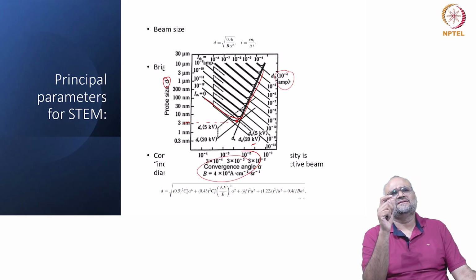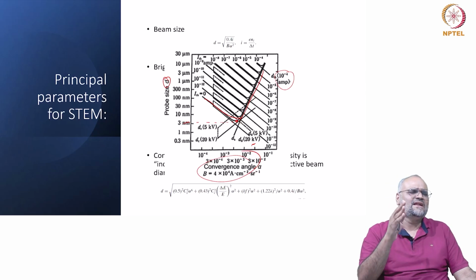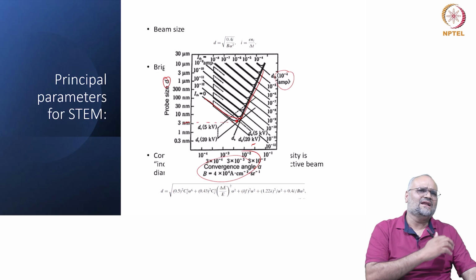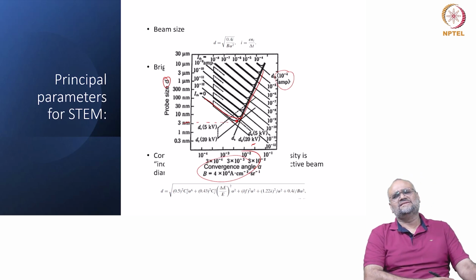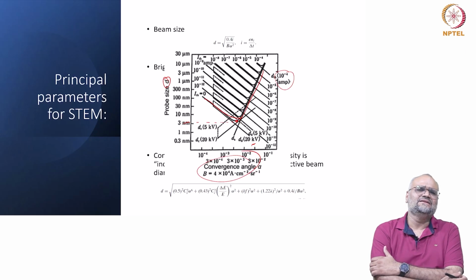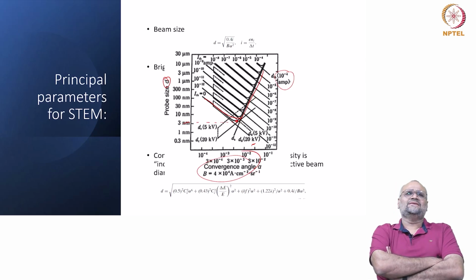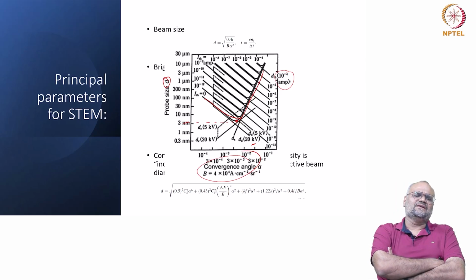And there is something that I would like to bring your attention to. When I talk about STEM as a different mode of imaging in TEM, it might be rather confusing or misleading on how scanning transmission electron microscopy is different from transmission electron microscopy. If you look at the concepts that were introduced in high resolution TEM, the ideas of projected potential, the parallel beams that are going through the specimen and satisfying the Bragg's diffraction and forming a sort of an interference pattern to get a high resolution TEM image.